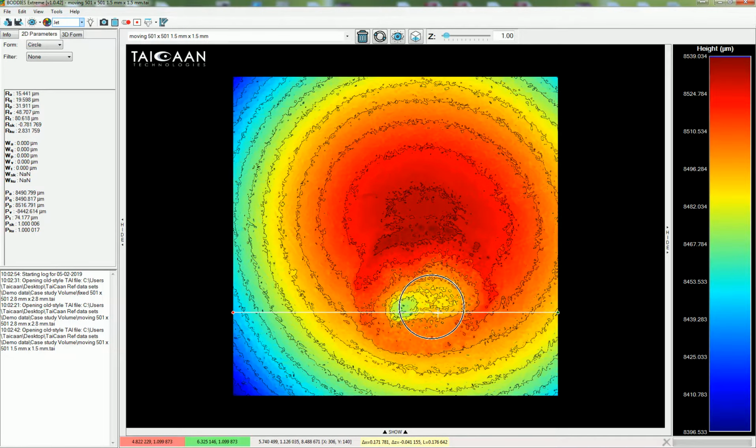What I can also do is just use the shift from the keyboard and just press the wheel on the mouse, and I can then just adjust the size of that particular circle, and we can find the size actually from the menu as well. But actually I just want to make sure that the region I'm selecting here is just bigger than the crater.